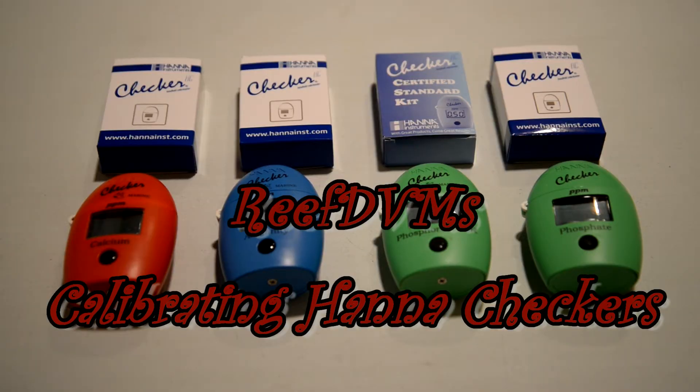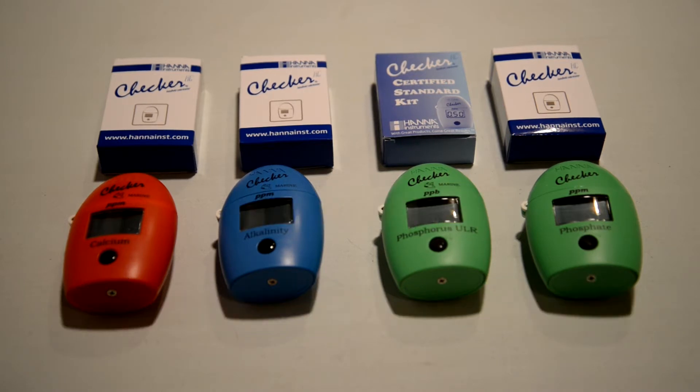Hello, ReefDVM coming at you today with a video showing how we calibrate HANA checkers for clients when we go into their houses and look at their testers. We do like the HANA testers, and we use the Triton test method where we send out water samples, but sometimes it's just nice to make sure that the HANA checker people own is actually functioning correctly.